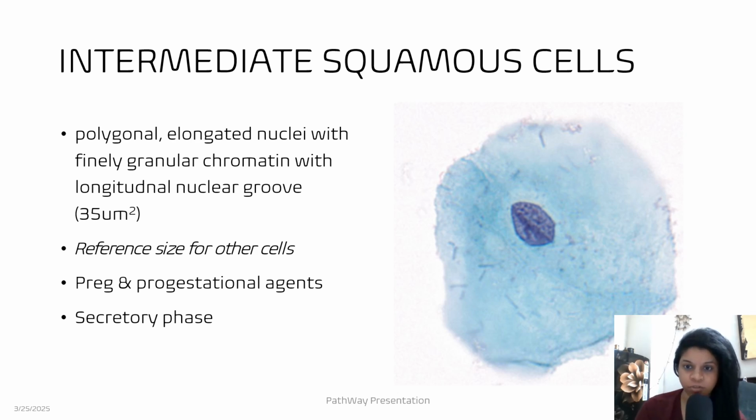Note that the cytoplasm is still very abundant, flattened, and diffuse. It's like a chapati flattened on a dough by an inexperienced person, which is not at all round.